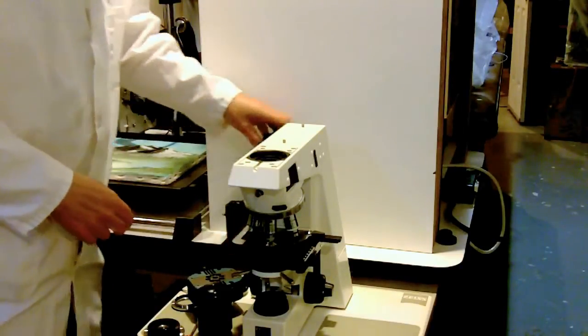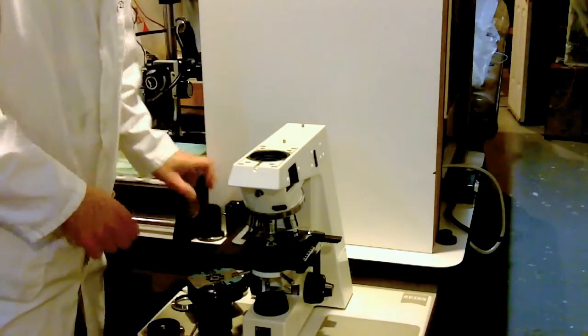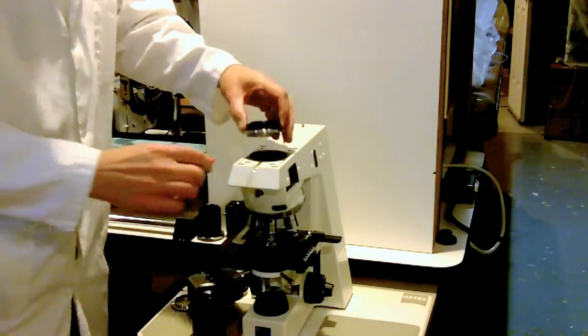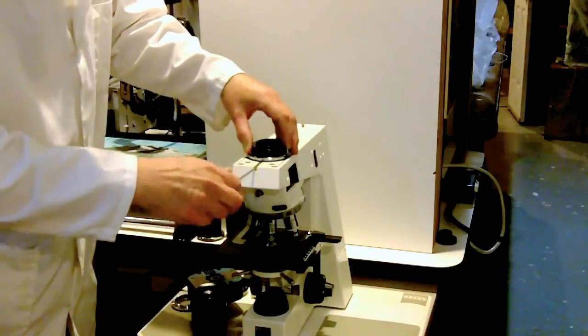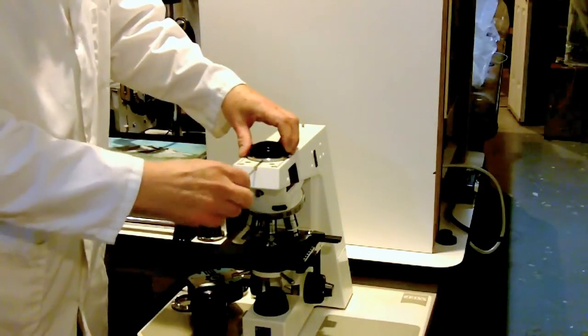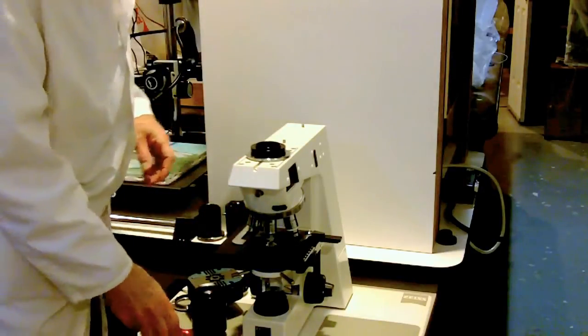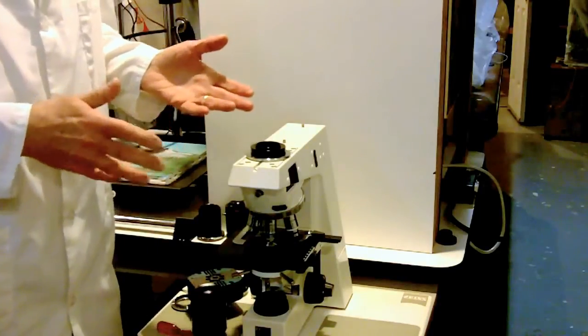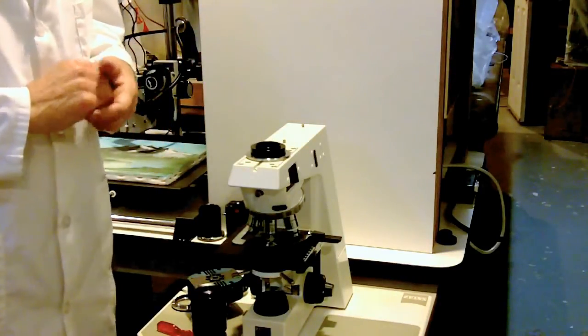So again, the idea of this InFocus component is to replace binocular and trinocular body tubes. Many times you'll find bare bones microscope stands on eBay, LabX, your own surplus warehouse.